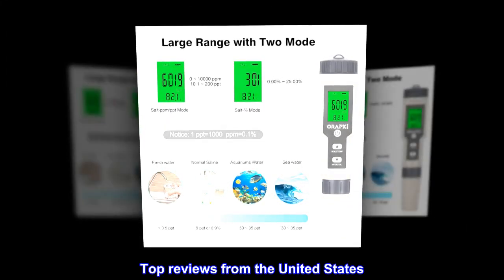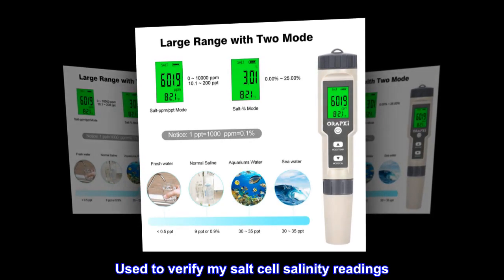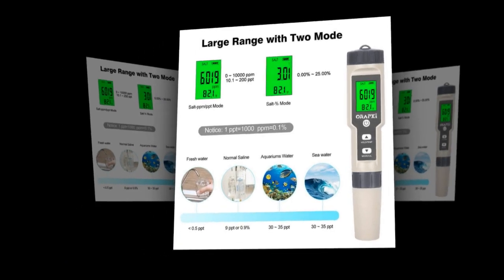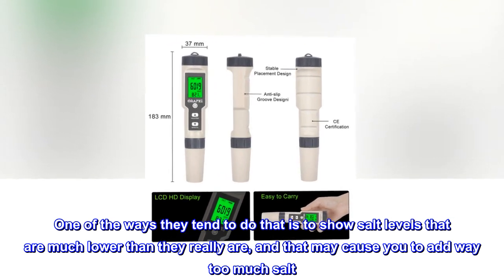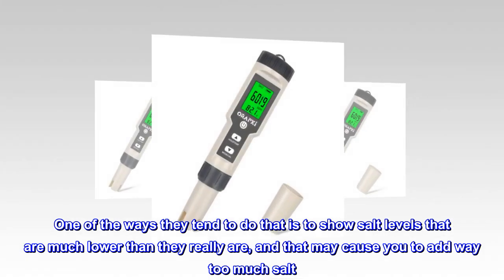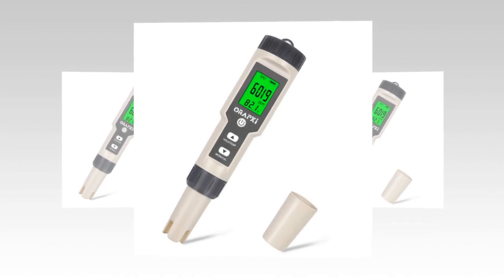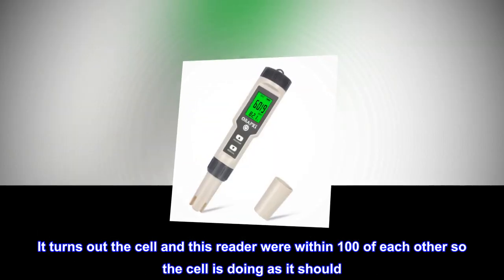Top reviews from the United States. I used it to verify my salt cell salinity readings. I have an old salt cell and was concerned that it was failing. One of the ways they tend to do that is to show salt levels much lower than they really are, which may cause you to add way too much salt. I also used salinity salt strips to compare. It turns out the cell and this reader were within 100 of each other, so the cell is doing as it should.